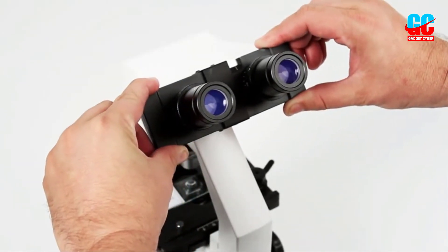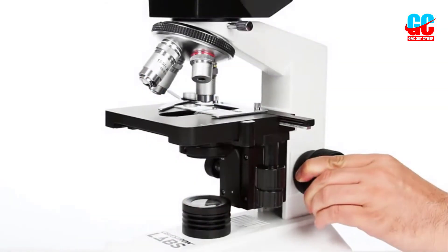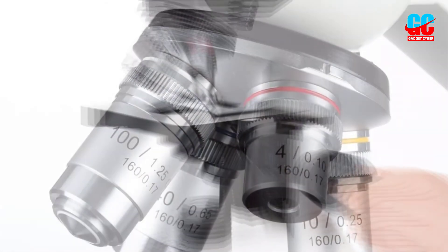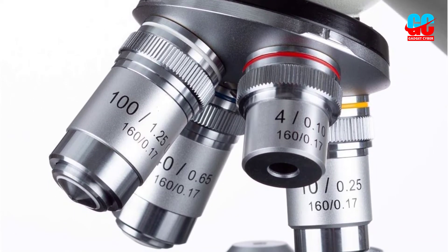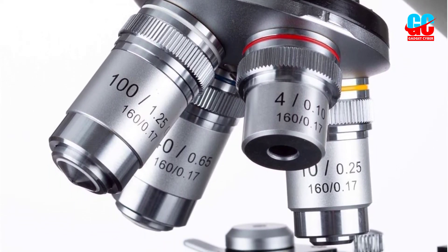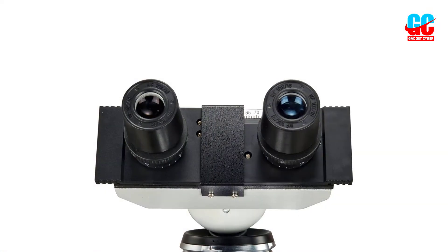Overall, we felt that the operation of this microscope was solid except for one glaring flaw. With the slide in place, you can't switch objective lenses because they hit the retaining screw when the unit turns. This adds quite a bit of work each time you want to change magnification levels and holds the OMAX microscope back from achieving our recommendation.